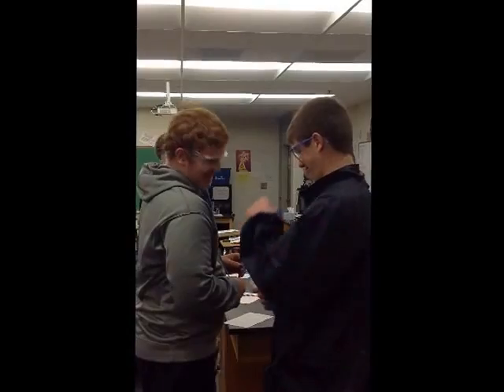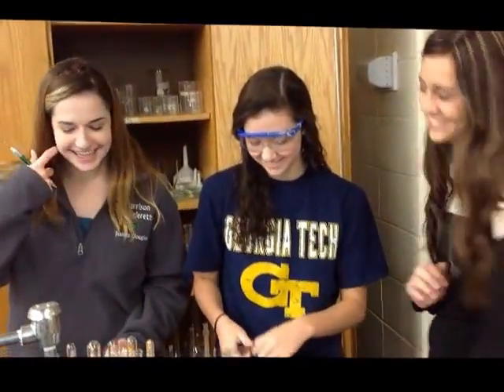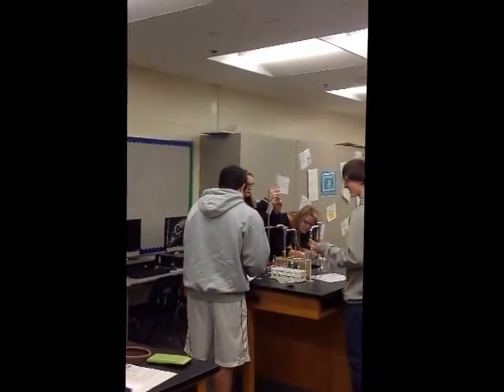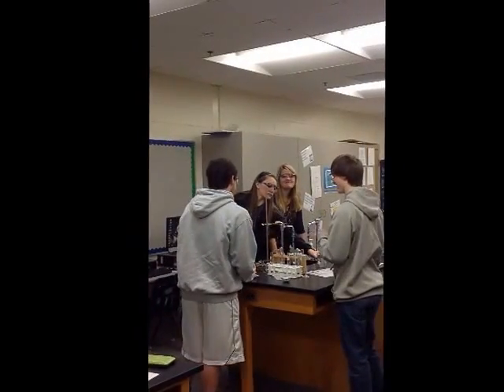Notice the goggles that Brian is not wearing and the goggles that Elena is not wearing. Danny, however, and Ben are both wearing their goggles, which is totally appropriate. Over here, Macy is leading the way with her junior self wearing her goggles. Unlike her lab partners, Madison quickly dons hers. I see that Abby is getting a certain amount of water in her graduated cylinder.